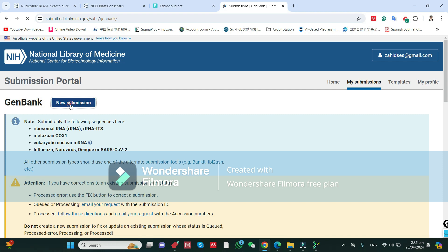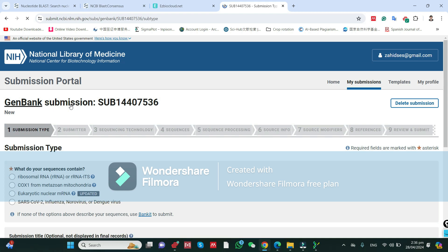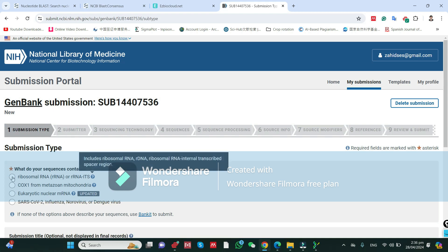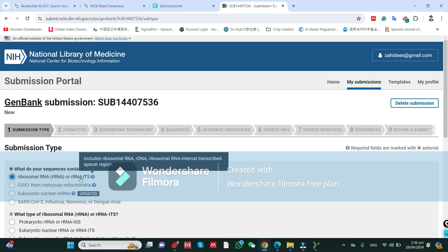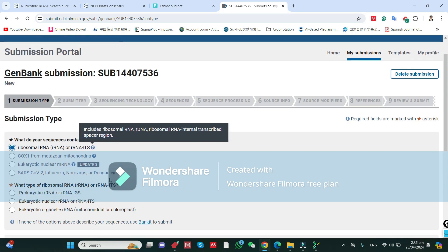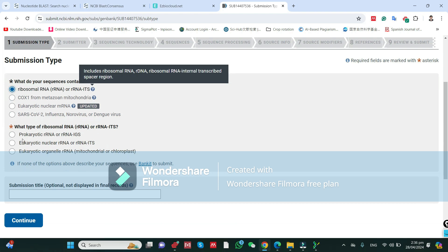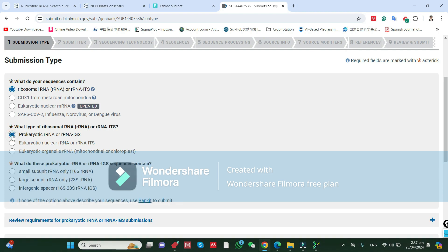Click on New Submission. Click on Ribosomal RNA. If you have a fungal sequence, which could be the ITS sequence, or a plant sequence which could also be an ITS sequence, you can click it here. Go down and click on Prokaryotic RNA, because bacteria are prokaryotes. I will click on Prokaryote.